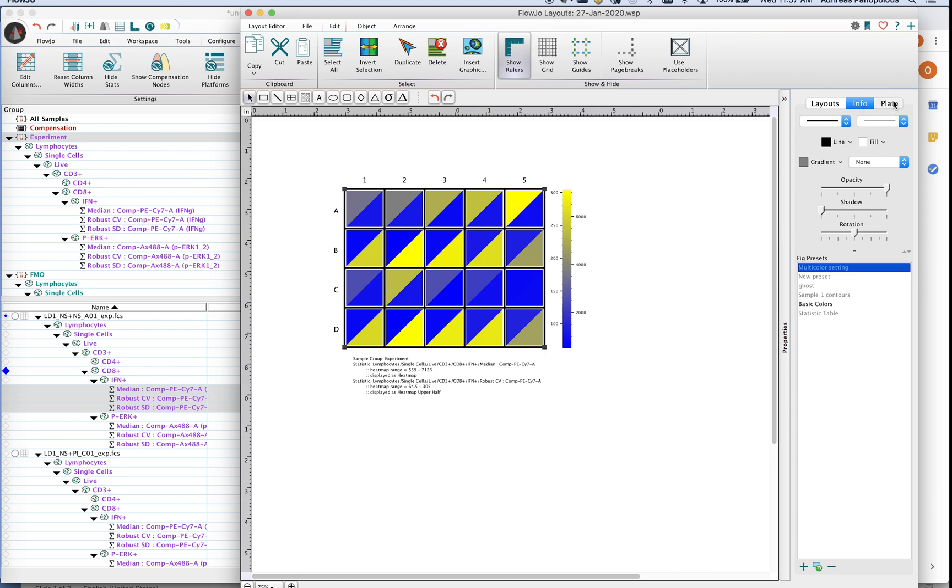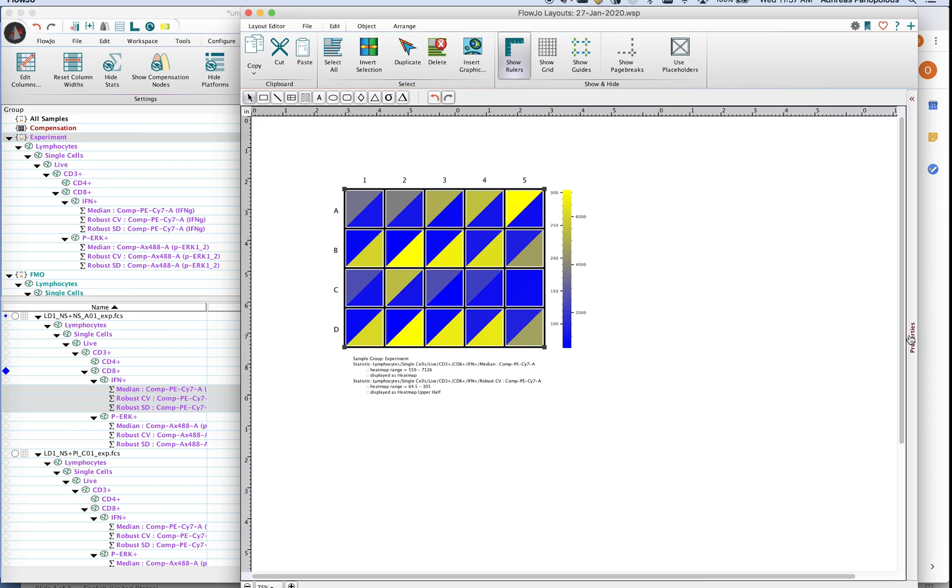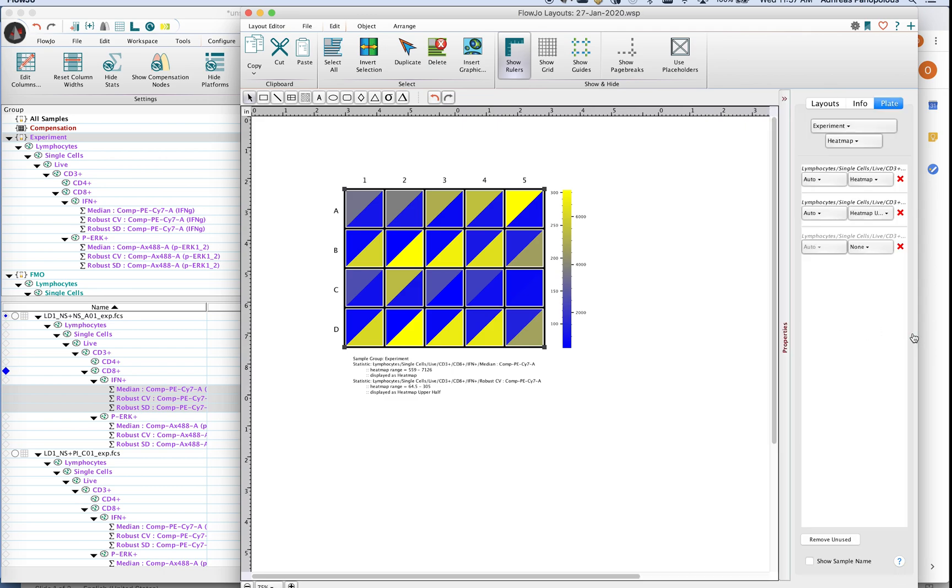So if we actually click on the plate tab here in the properties pane, sometimes the properties pane may be collapsed. You may have to expand that menu when you are working with the plate tool.